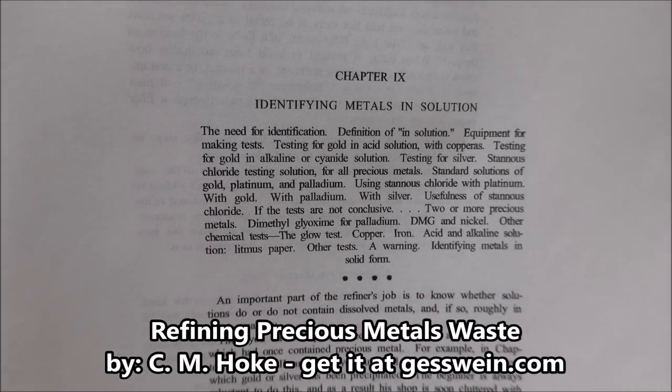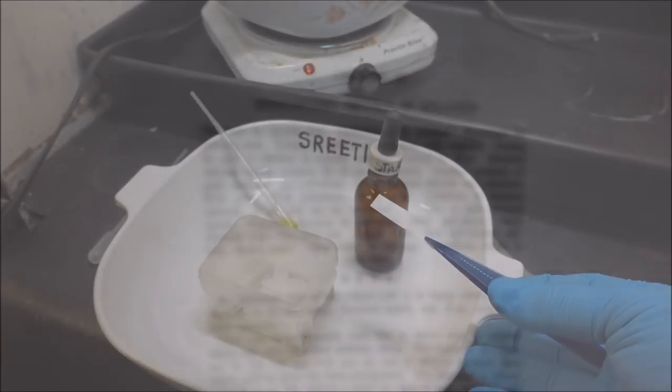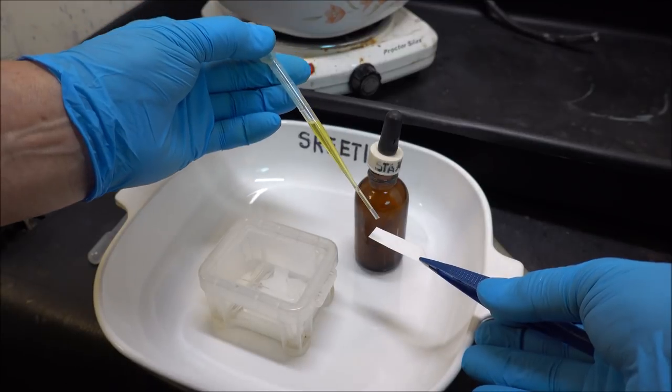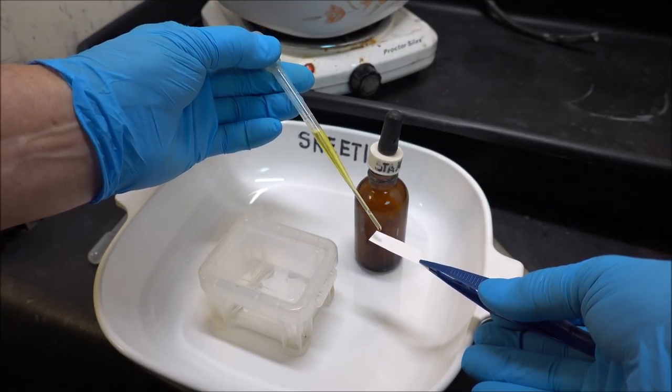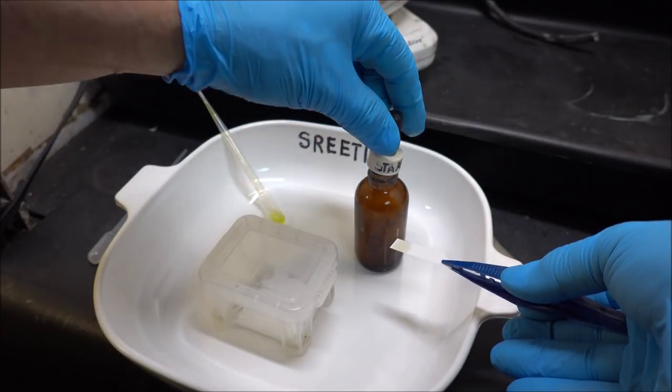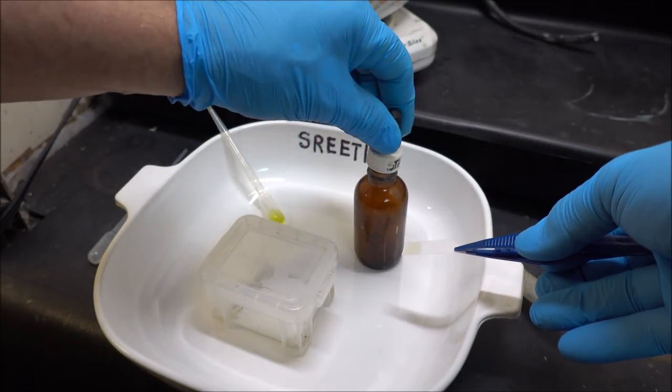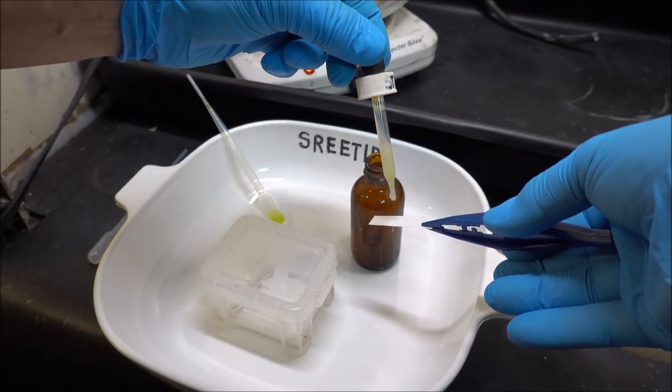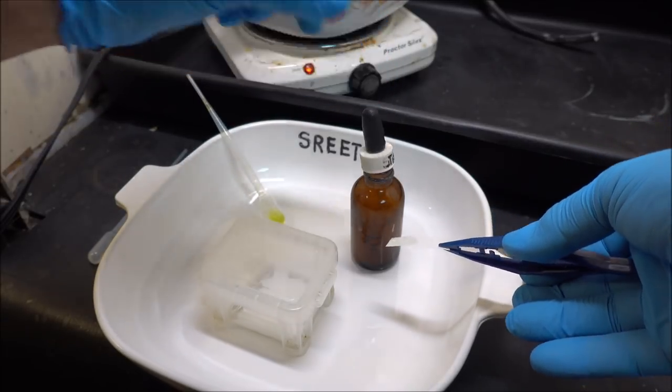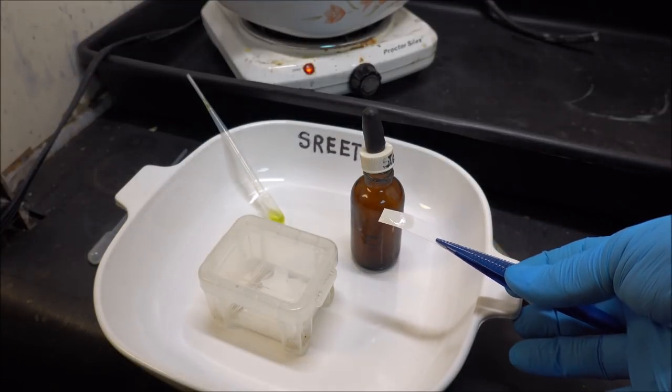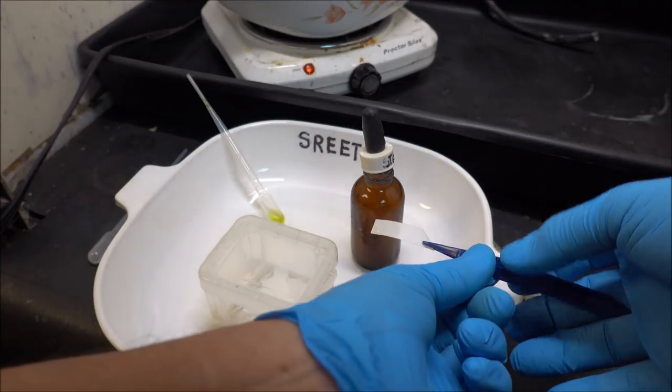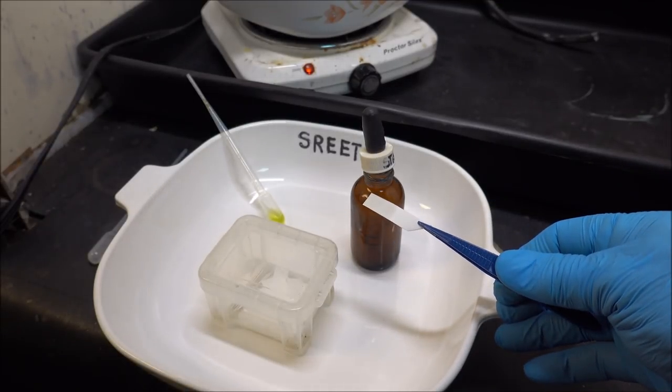I got the information for identifying those metals in solution out of Hoke's book in Chapter 9, Identifying Metals in Solution. Before we go any further, I'm going to put a little bit of our solution on a piece of filter paper here and do a stannis test, just to make sure we don't have any precious metals in solution. There you see, nothing. No kind of reaction for precious metals in solution.